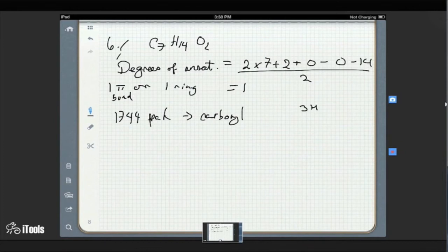N equals 0. Maybe we have... So like that's what I was saying, there are a bunch of possibilities. Let's just say that there's a methyl or 3 CHs. What about this broad one with the 1H? That's like saying there's 1H attached to a carbon with many other hydrogens on it, but we can't tell how many because it's so split.